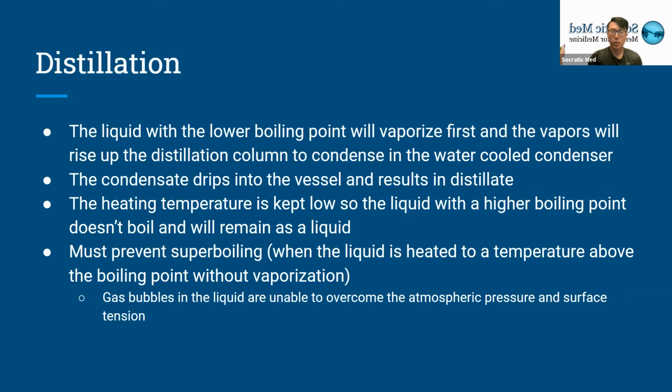As the temperature rises, it will stop boiling the first liquid, because it will all have boiled and dripped out as condensate. The liquid left over in the distilling flask will be the other liquid with a higher boiling point that hasn't boiled yet, and will remain there until the temperature rises to that boiling point, and then it will come out as a condensate as well.